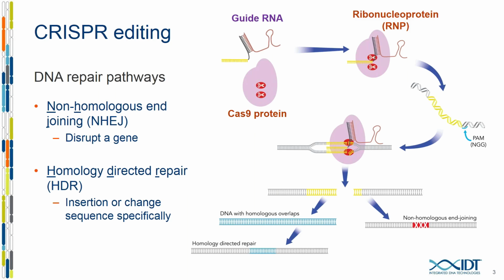Once that double-strand break has occurred, then we either rely on a non-homologous end joining process, and that's the more error-prone process where typically an insertion or a deletion event can occur, or we rely upon homology-directed repair, where a template piece of DNA is used to align and repair either as an error-free process, or if you're introducing a specific mutation, that can sometimes be included in the middle of that repair template, and we'll talk about that towards the end of the presentation.